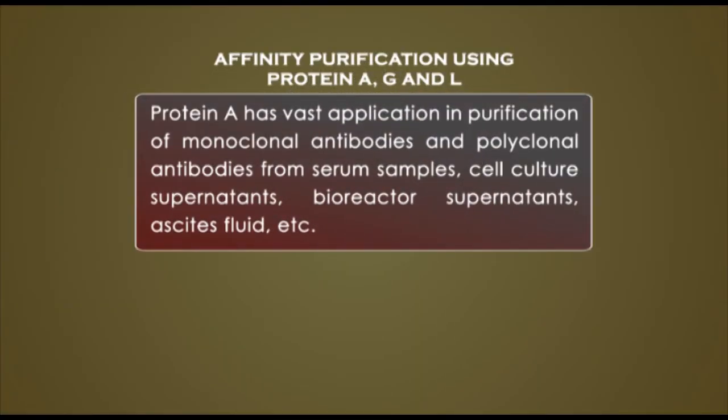Therefore, protein A has vast application in purification of monoclonal antibodies and polyclonal antibodies from serum samples, cell culture supernatants, bioreactor supernatants, ascitic fluids, etc.